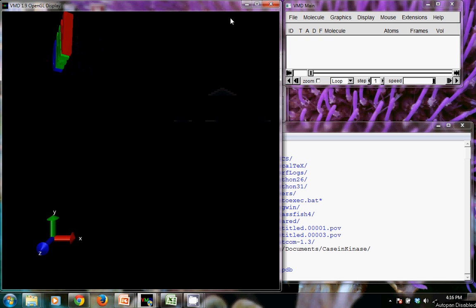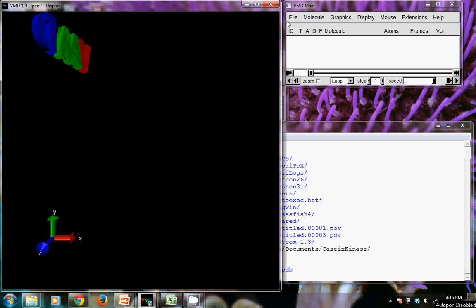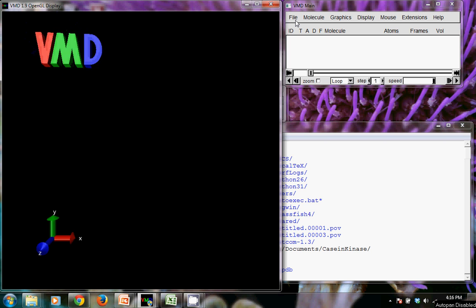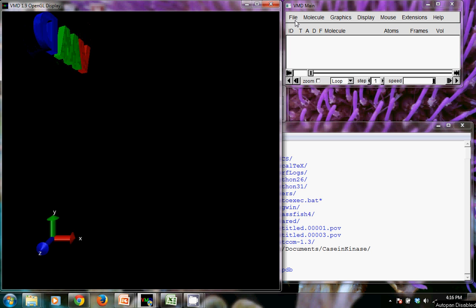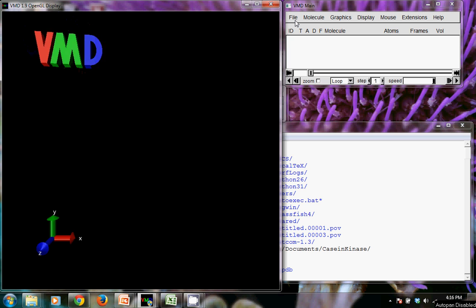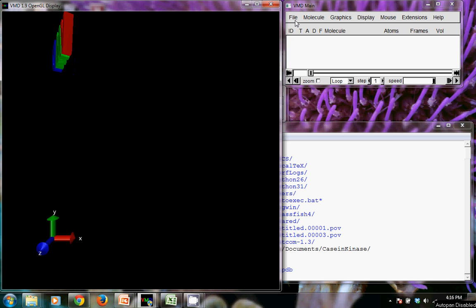All right, so the next step that we want to do is create what's called a protein structure file that will have an extension of .psf. What it does is it tells NAMD about charges and ionization states.